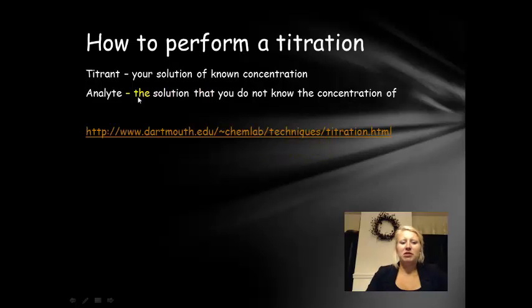So how to perform a titration? The titrant is your solution of known concentration. So this is what you know. The analyte is what you don't know the concentration of. So what we're going to do is we're just going to watch this short little video about titration.